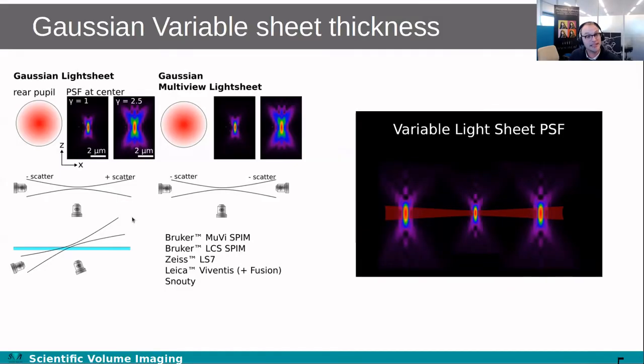And of course, Huygens then has the spatially varying PSF. So Huygens makes the view into many smaller views, has a different PSF for each, and thereby it can correct the effect of the Gaussian, the variable PSF along the Gaussian.